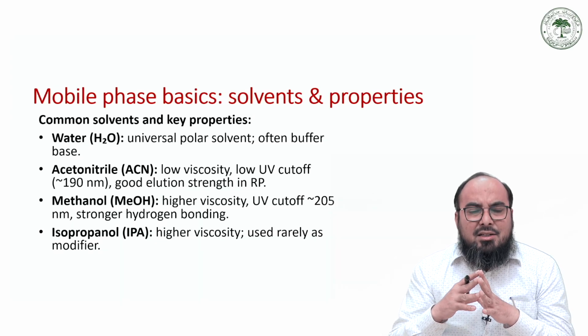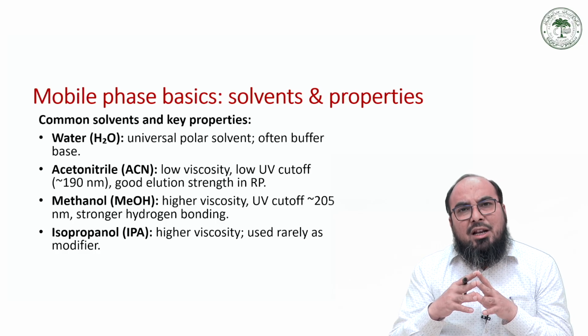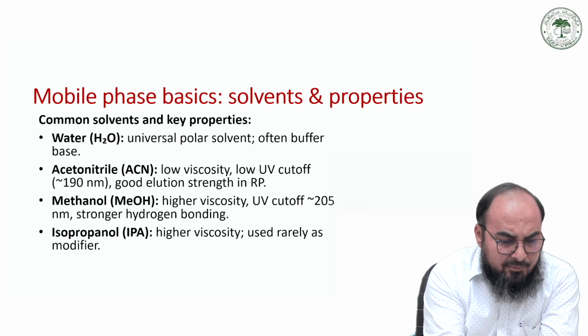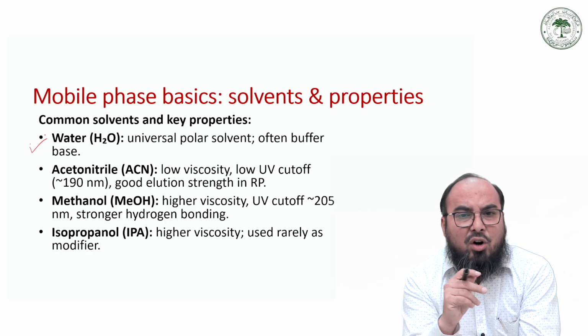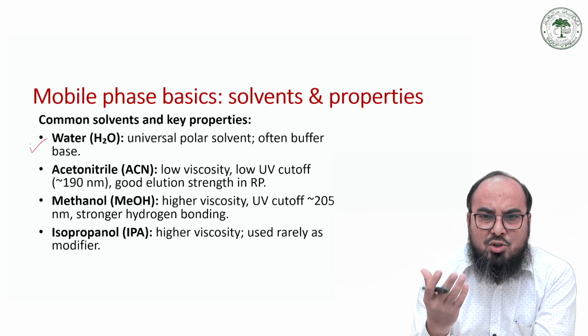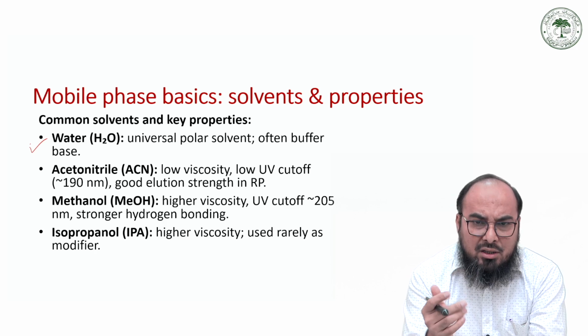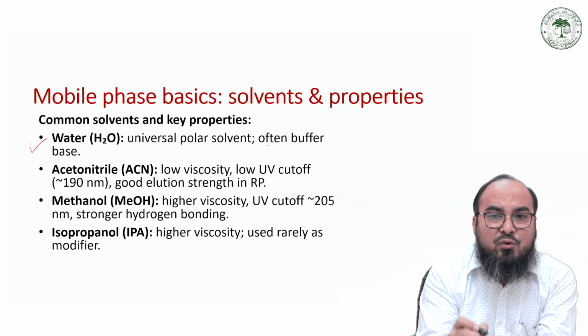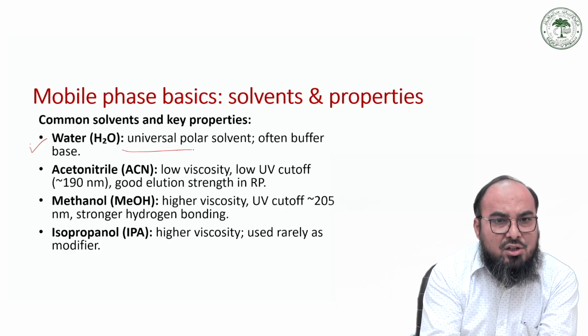So again, there are certain issues, certain points which you have to remember with regard to selection of the mobile phase. So initially you have to look for certain solvent. For example, if you are using water, then you know that water is a very polar solvent, and most of the buffers are made in water. So water is also a base for the different buffers. Water is also a universal solvent.